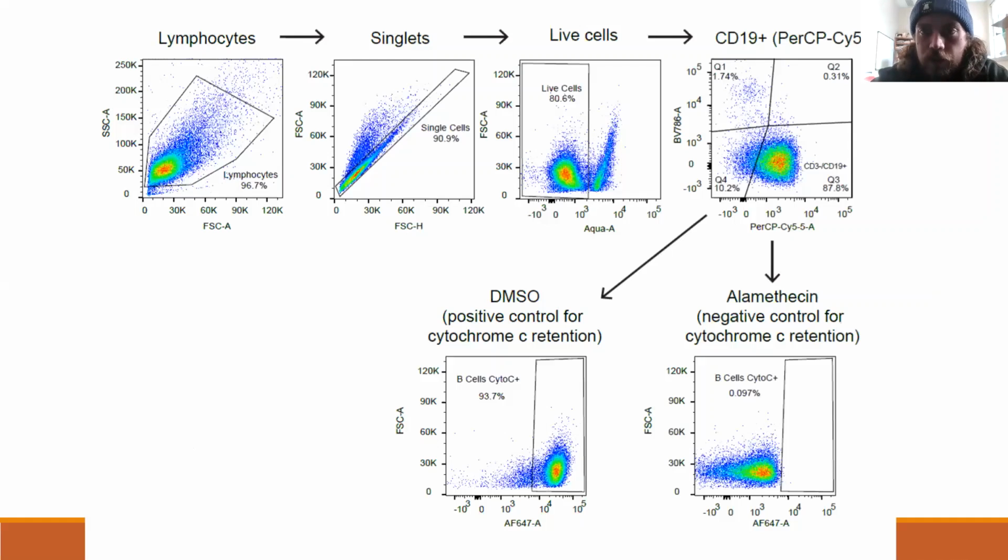Now I'm going to start detailing a little bit of the analysis and looking at some experimental examples. This is a good example of a gating strategy for a specific sample, where you gate your cells of interest based on cell size exclusion. Here I'm gating my lymphocytes. It's a pretty homogeneous sample, so it's pretty easy.